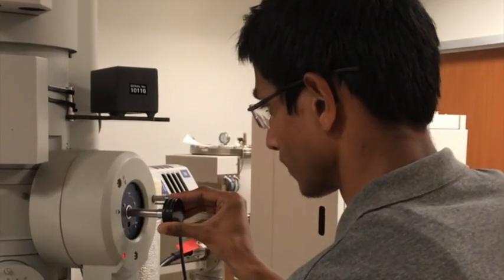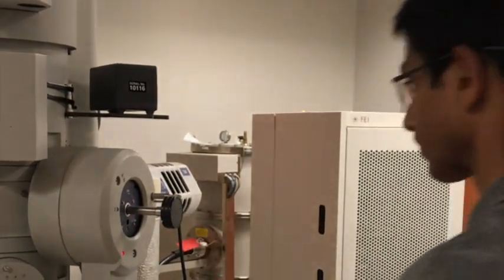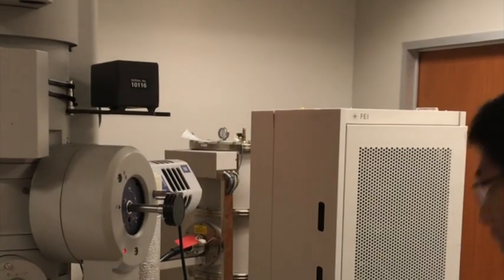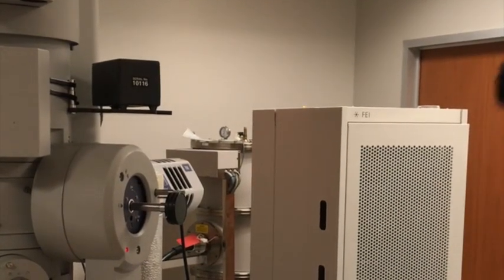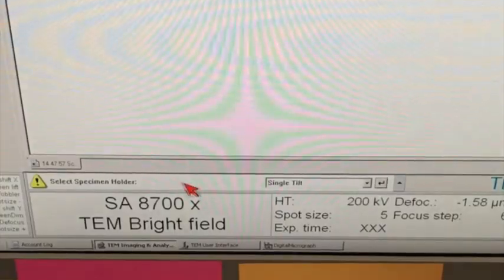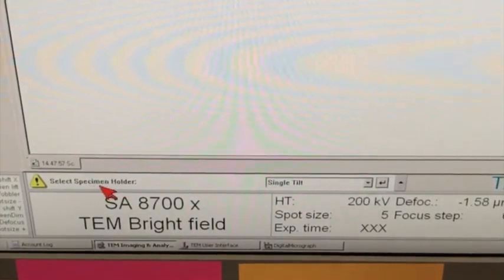Now you see the red light is turned on and the turbo pump is automatically turned on. On the computer screen, it asks you to select the specimen holder.